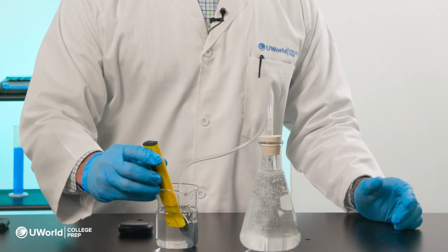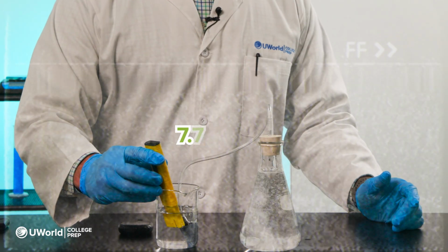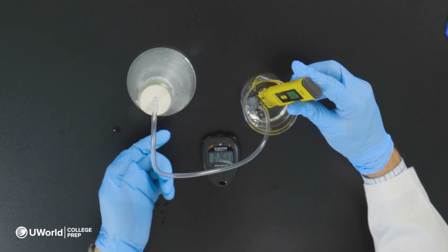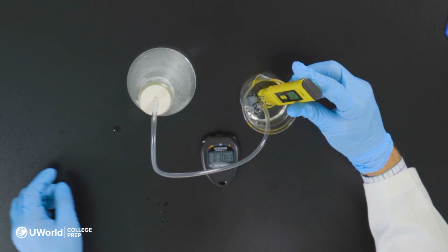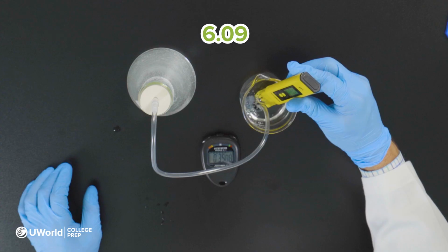We started at a pH of 7.64. And we're getting close to our 30 seconds here. And you can see all this carbon dioxide that is being created is getting pushed into this water. At 30 seconds, we have a pH of 6.09. And it's quickly dropping.